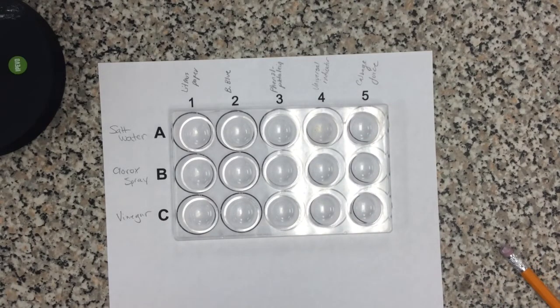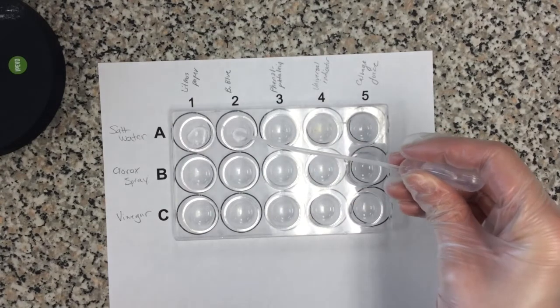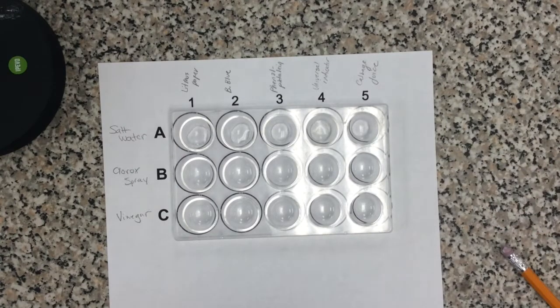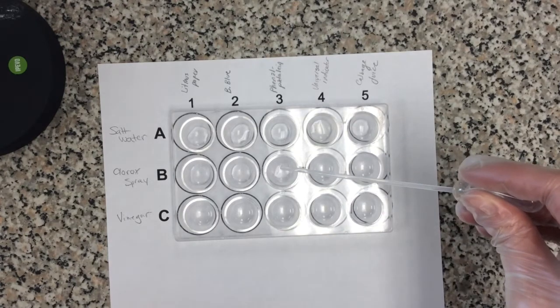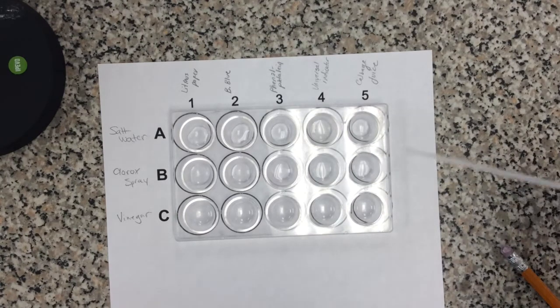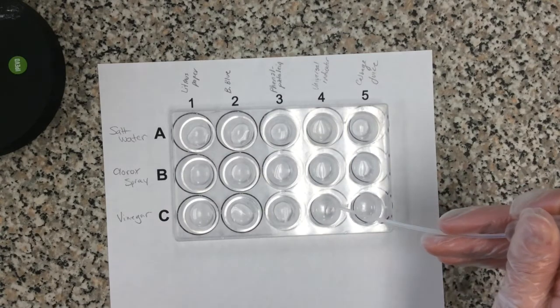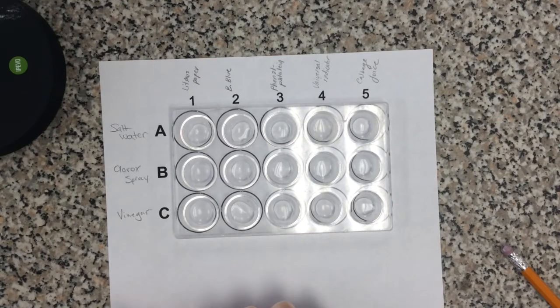Okay, 5 drops again of my samples. All right, so now that we're all set up and we have our samples in our wells again, we're going to go ahead and try out that litmus paper once again.